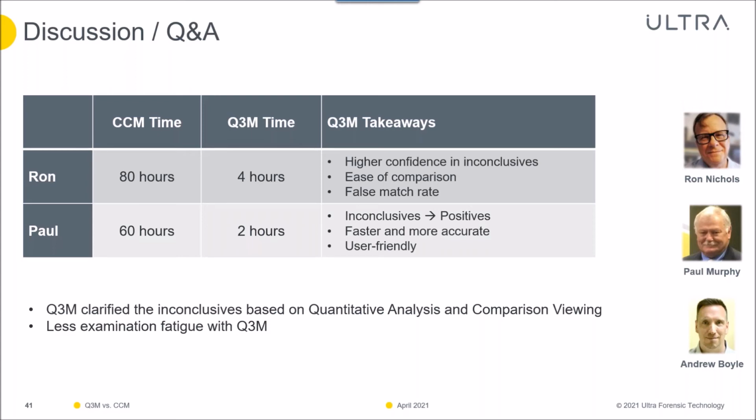Okay, all right. And I guess this is a question for both of you, although Ron's touched on it already, but do you see 3D microscopy replacing the conventional comparison microscope? I don't, because right now there's the issue of tool marks, and there's a lot of things that won't fit into the quantum 3D microscope to be imaged, and we will receive casts from crime scenes, whether they be burglaries of FFLs or scrape marks from a safe or what have you.